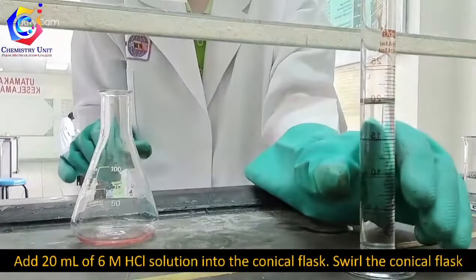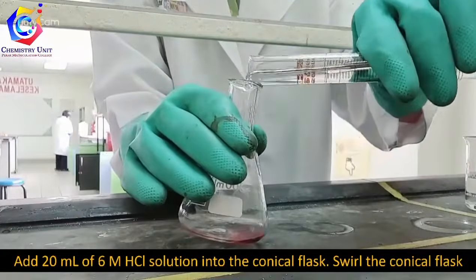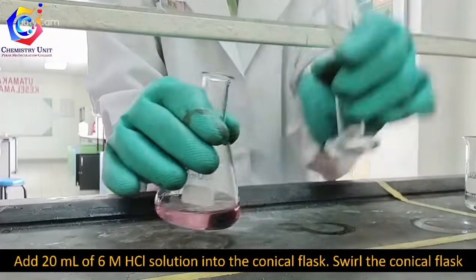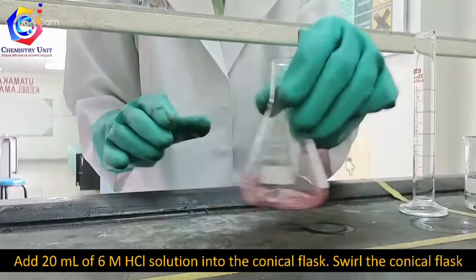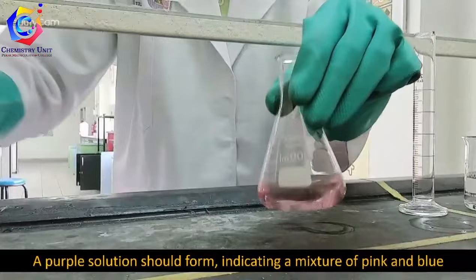Add 20 ml of 6 molar HCl solution into the conical flask and swirl. This ensures you have a homogeneous solution.